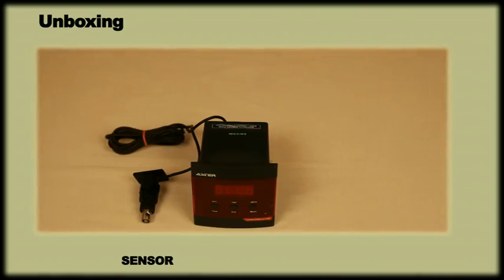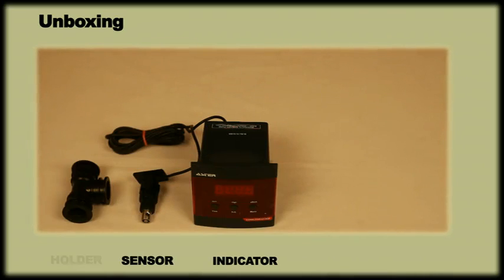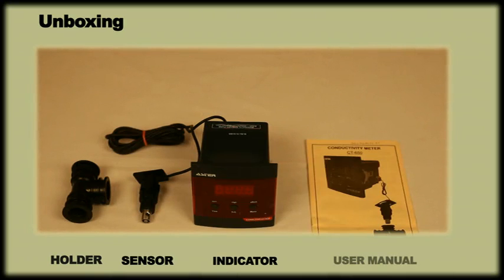Unboxing. The entire package is supplied with a sensor, indicator and a sensor holder along with the user manual.